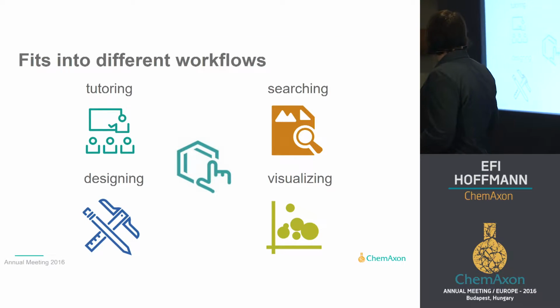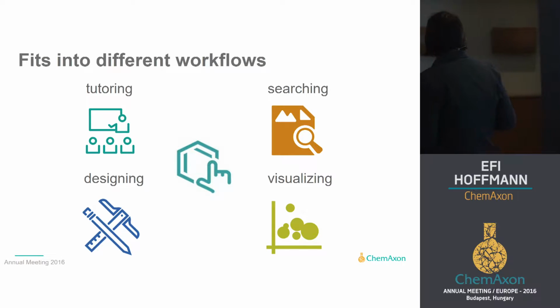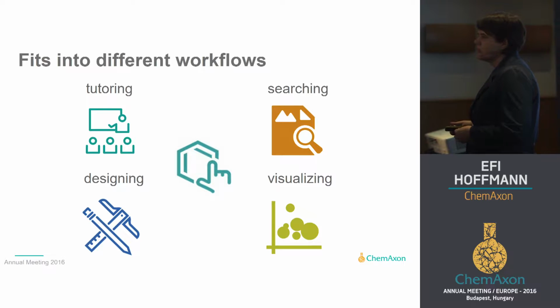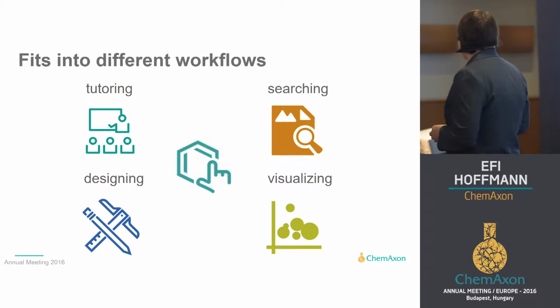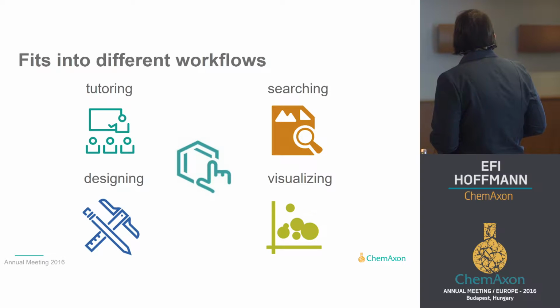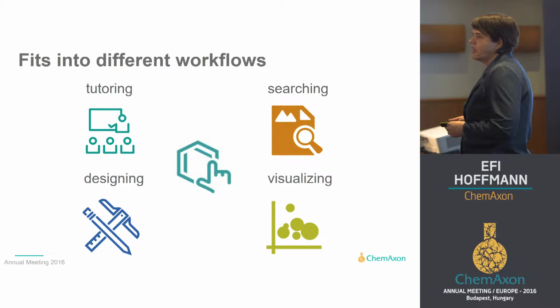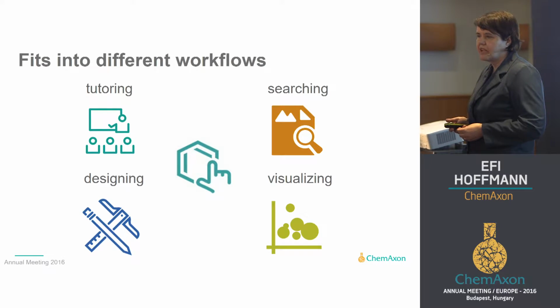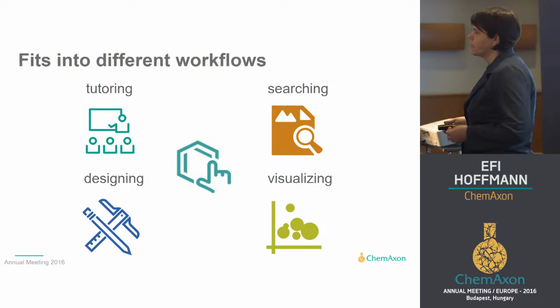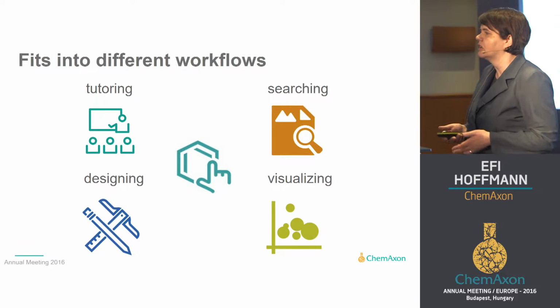Just to take a look, you could see several examples yesterday in the partner session of how Marvin JS is integrated. Today you will see examples of how it is used in education in Nishana's presentation. You also saw examples for searching, for example the compliance checker, or designing. You will see the IDBS presentation or the Marvin Live presentation today, or visualizing, which can happen if you just want to show one molecule or more in a browser.